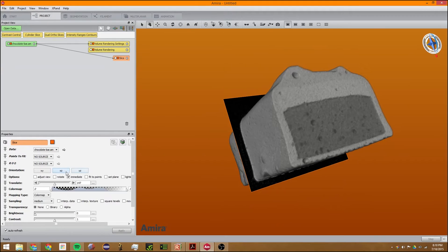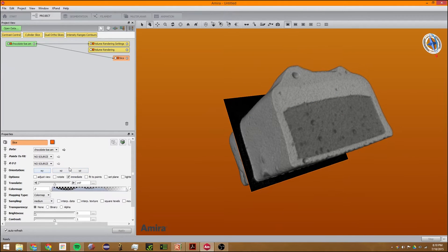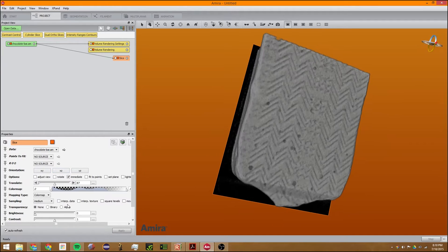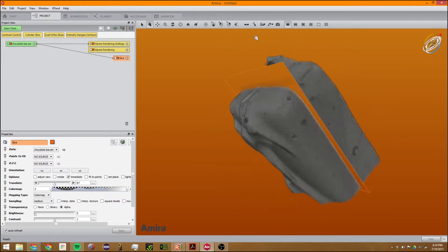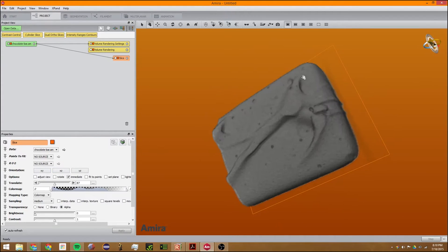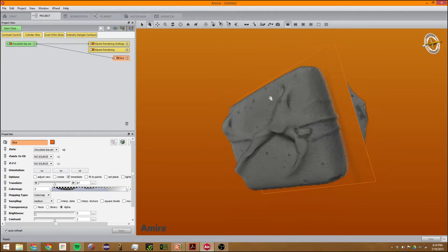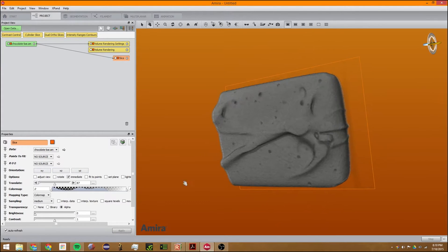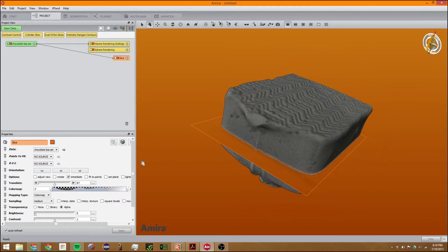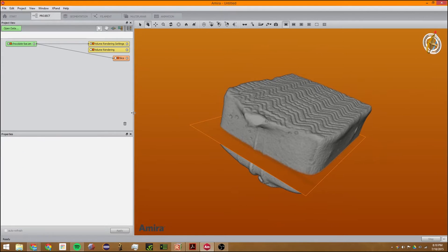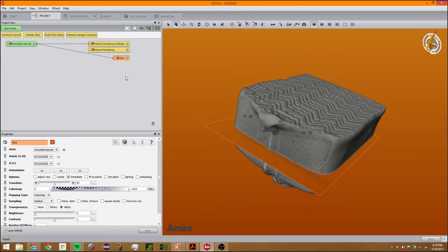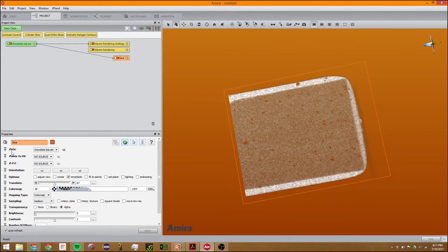You can also change it to alpha to make the outside transparent, much like volume rendering. The other thing you can do with volume rendering or ortho slices is cut stuff. We can turn this off and just get the sliced chocolate bar.